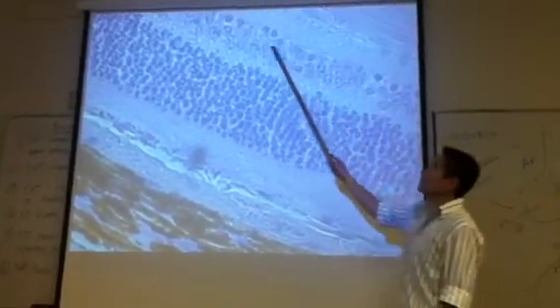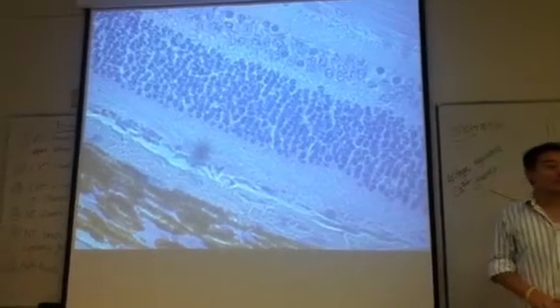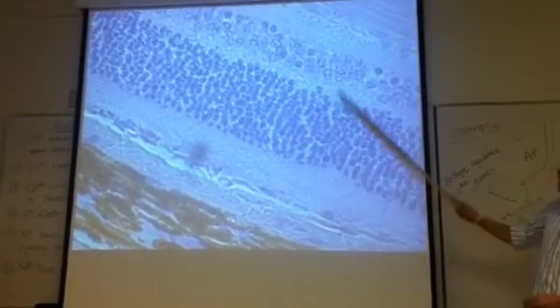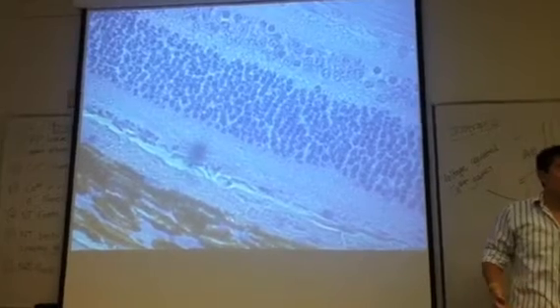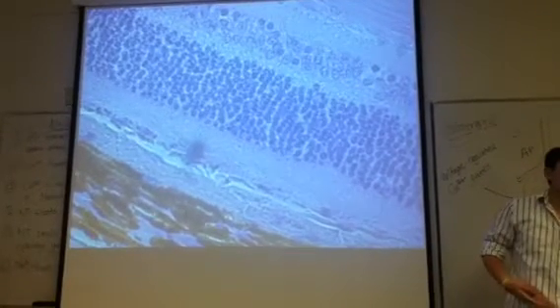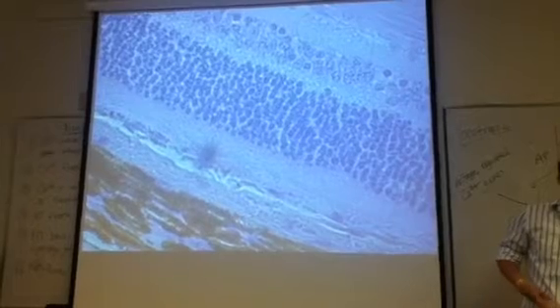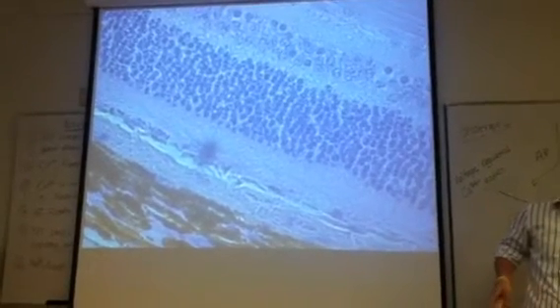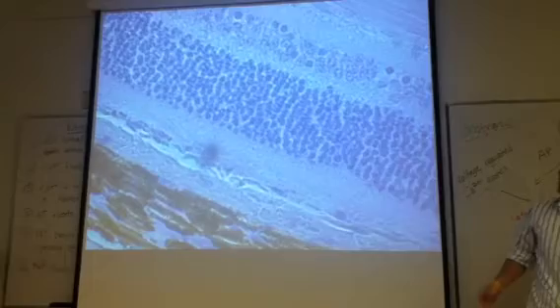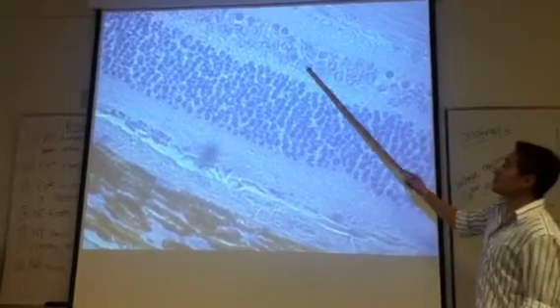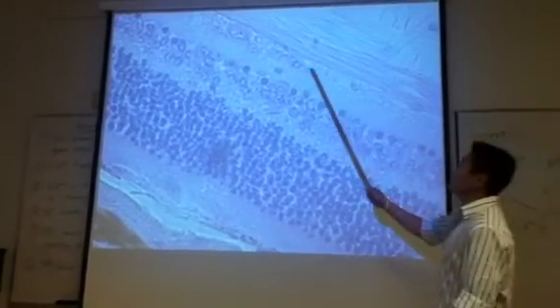So then what is this layer then? Which layer? This one right here? The bipolar cells. Part of the bipolar cells. What is this layer? About the somas of the bipolar cells. Right, the soma or the nuclei of the bipolar cells right here. That's what all those little circles are? Those are the nuclei?